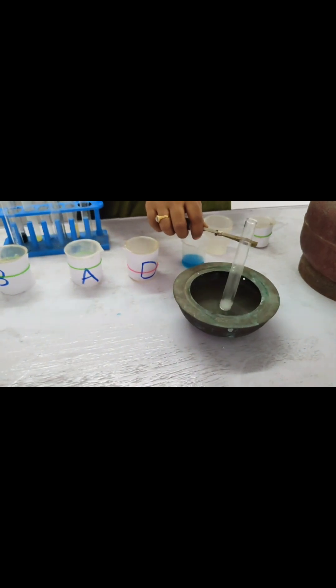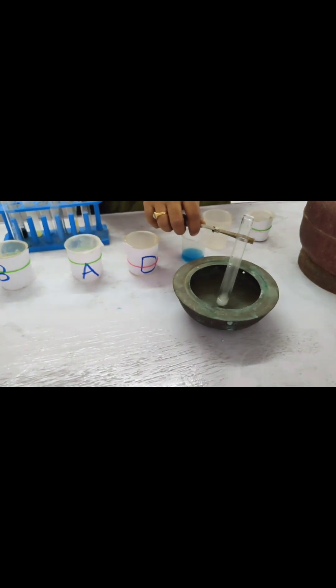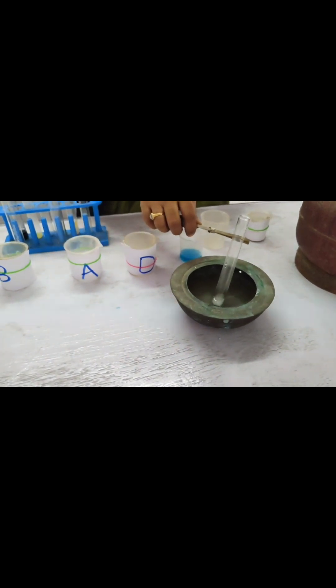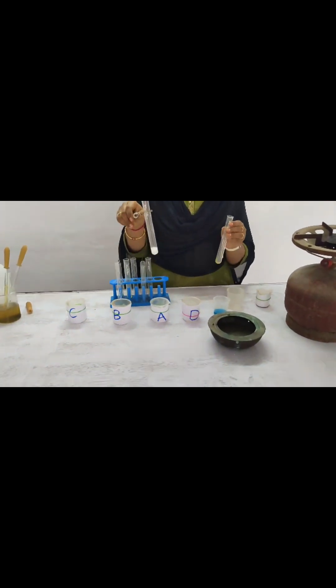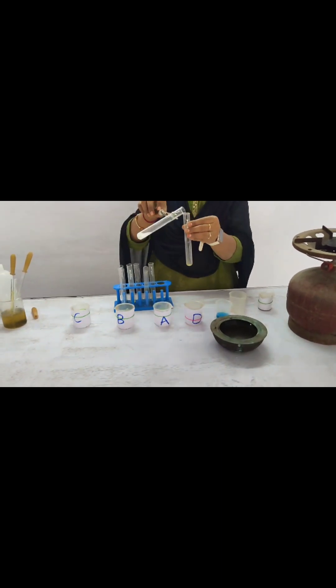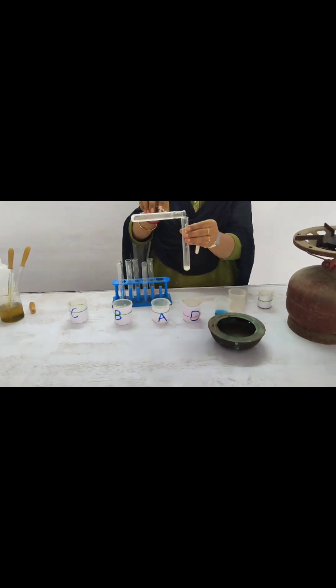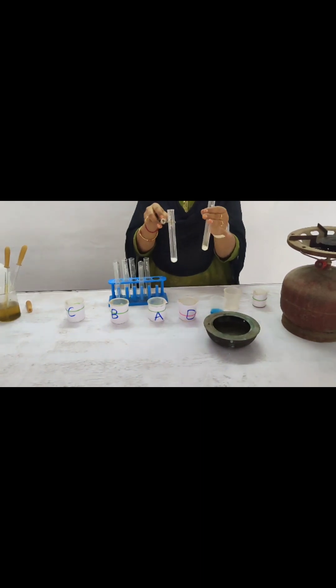Likewise, here the starch converts into dextrins and maltose by the temperature. For that purpose, we have to keep the sample in the water bath for 15 to 20 minutes.